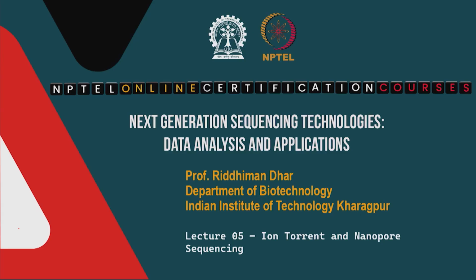In the last few classes we have introduced some of the recent NGS technologies. We have talked about Roche 454, we have talked about Illumina, and in the last class we have talked about SMRT sequencing. In today's class we will discuss two sequencing technologies in brief. One is called ion torrent sequencing and the other is nanopore sequencing. So, that is the agenda for today's class.